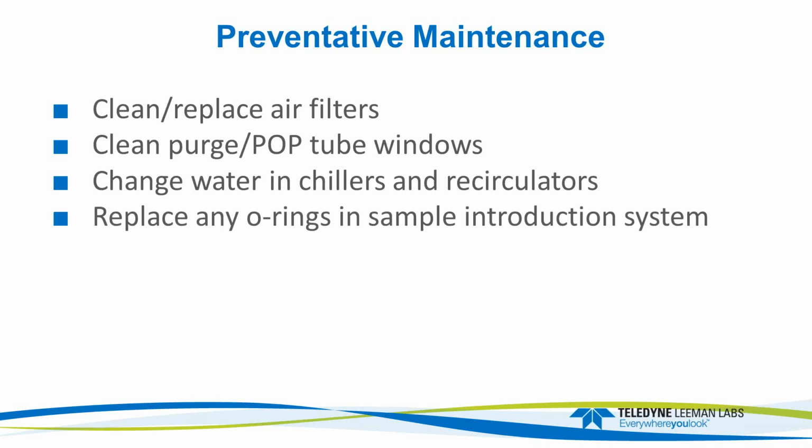Sample introduction O-rings. They're what isolate that sample introduction system from the outside world. You don't want to have air leaking in there, right? Or actually have things start leaking fluids out. Simple things. Just change those O-rings. Change the pump tubing, right? Not necessarily because it's worn out, but just don't let it go so long that it falls apart and you have acid getting into that peristaltic pump in there.